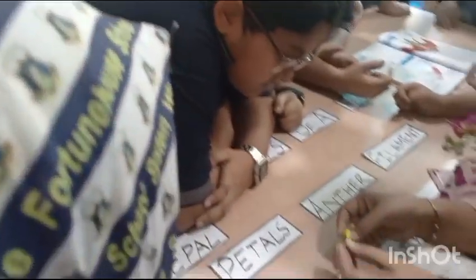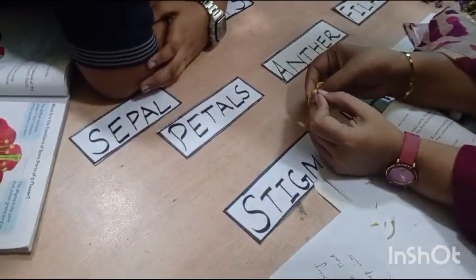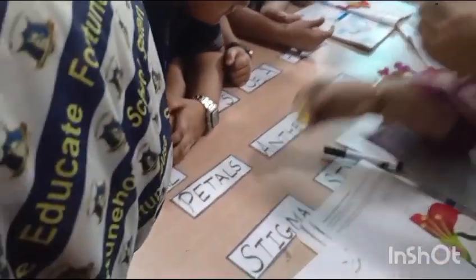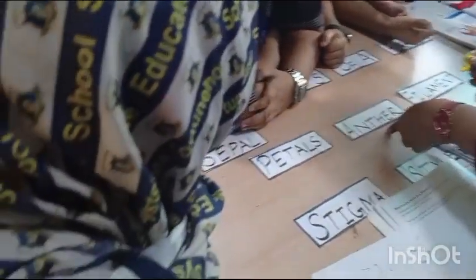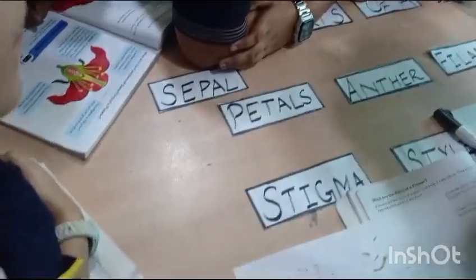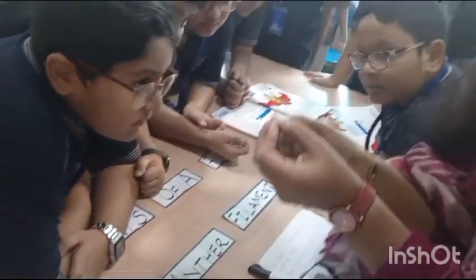This part is the stigma of the flower. What is the function of the stigma? It receives the pollen grains. And from where does it receive the pollen grains? From the anther. And the anther is the male part. You can see that these are the pollens and they are present on the stigma.